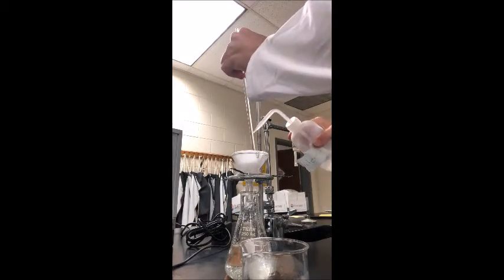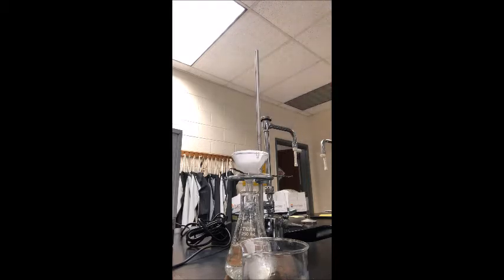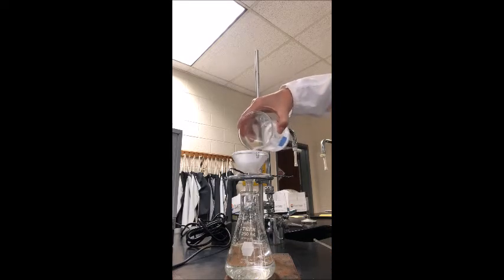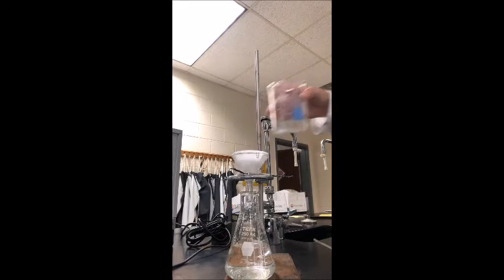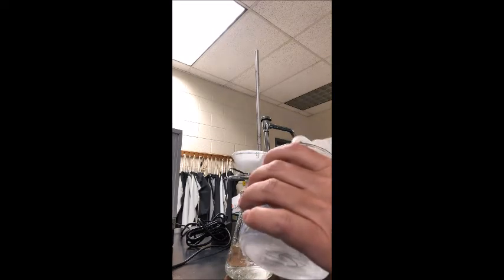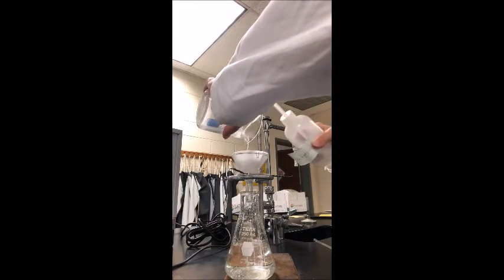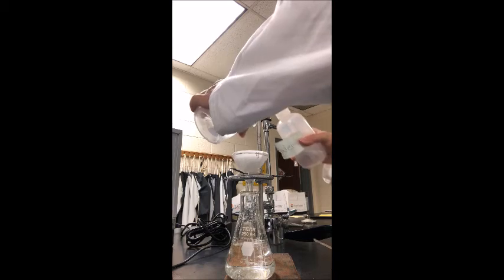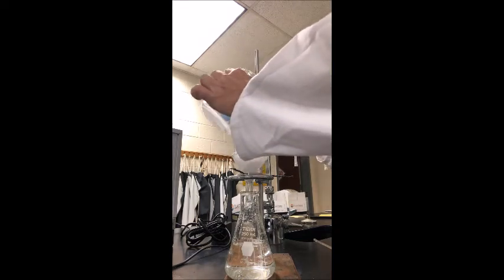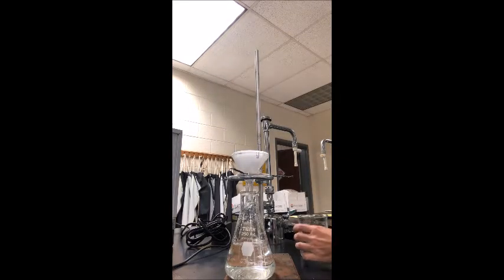I'll even rinse off the stirring rod here, make sure that's transferring, and swirl that around, pour that in there. Okay, do that a couple more times. Rinsing out the beaker, making sure we're getting all of it to go into the filtrate. And now the beaker looks pretty clean. One more time, one more rinse, and we're ready to go.